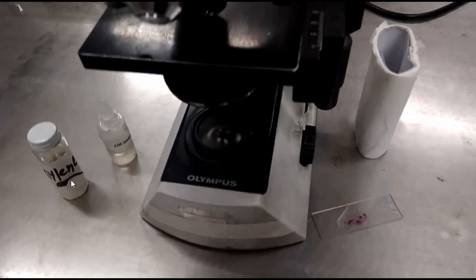So this one is the xylene used to clean the lenses. This one is tissue paper, an alternative to wiping lens paper.